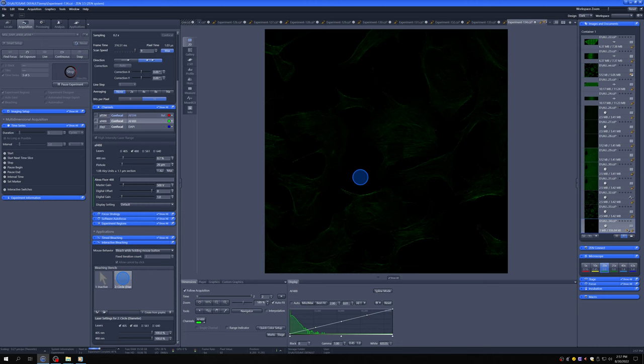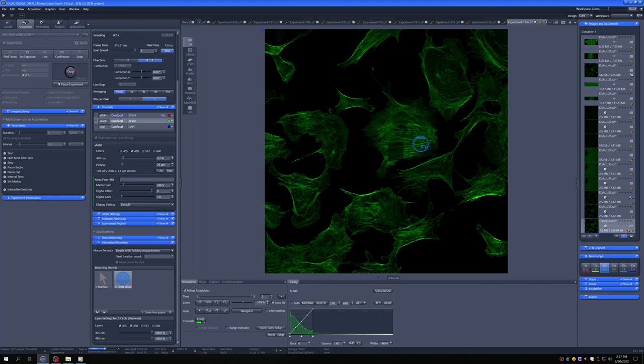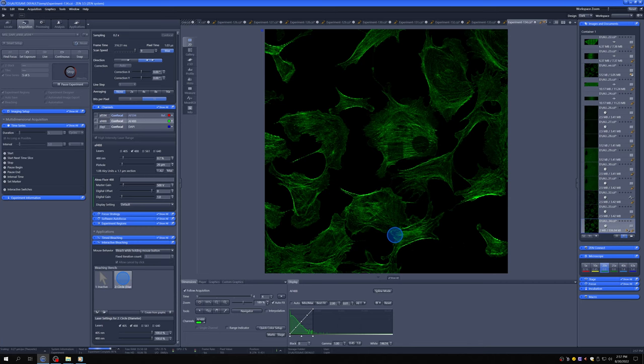So if I click here you can see that I've bleached a little bit, and I can click as many times as I want and bleach interactively as the experiment progresses.